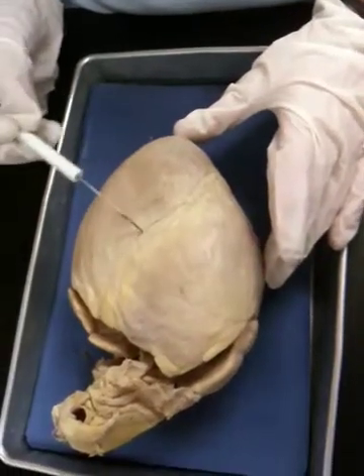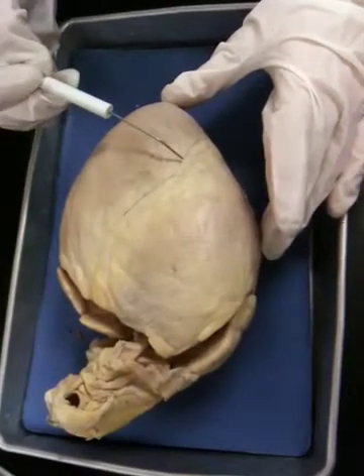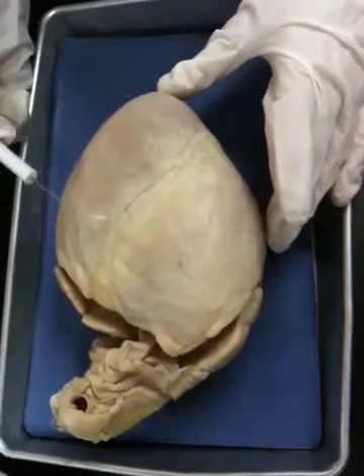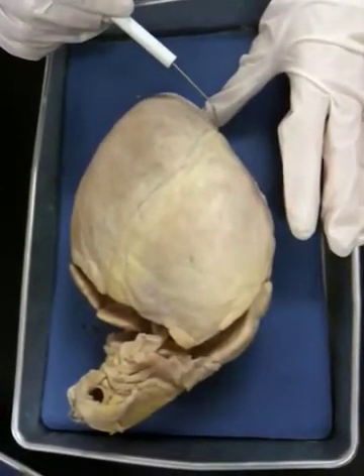We have this seam that comes down the middle on the anterior side, and this is the interventricular groove, or sulcus, that's going to house the interventricular artery. It's a nice little seam — it kind of looks like a sash on a pageant.